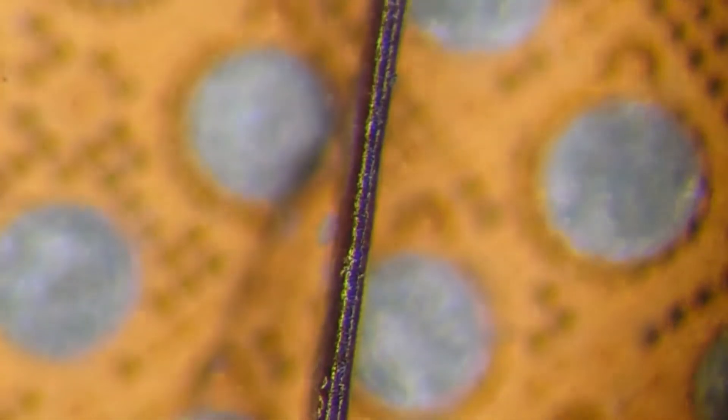If we watch carefully we can see some structure on the hair, not that easily seen, frankly.